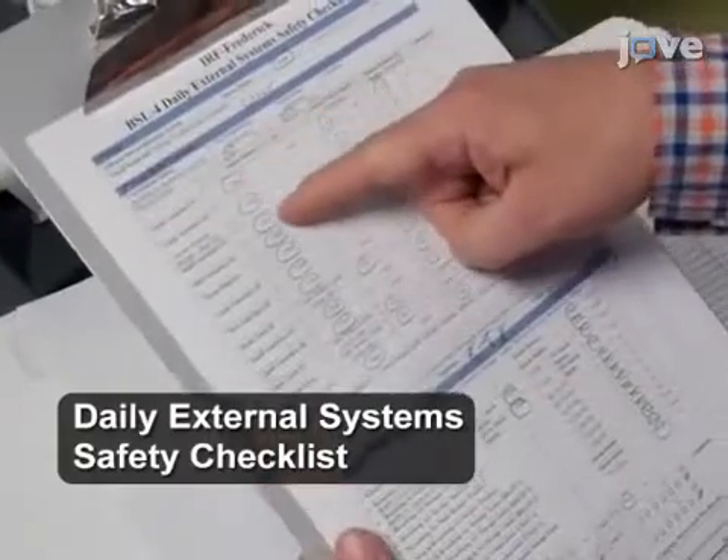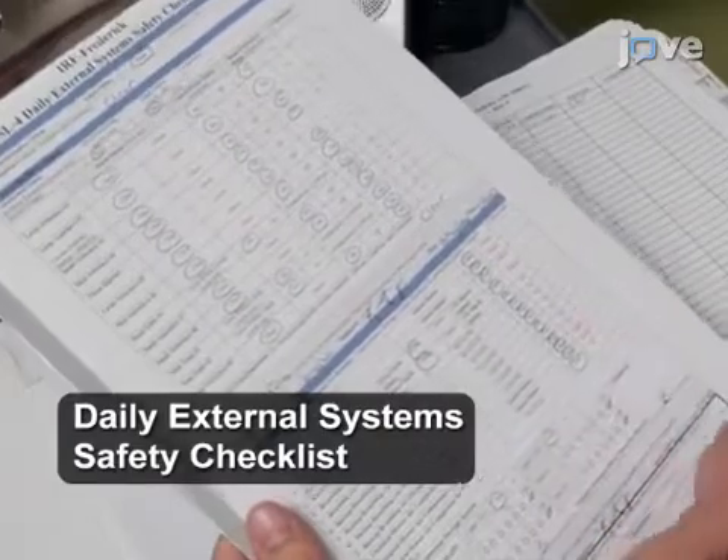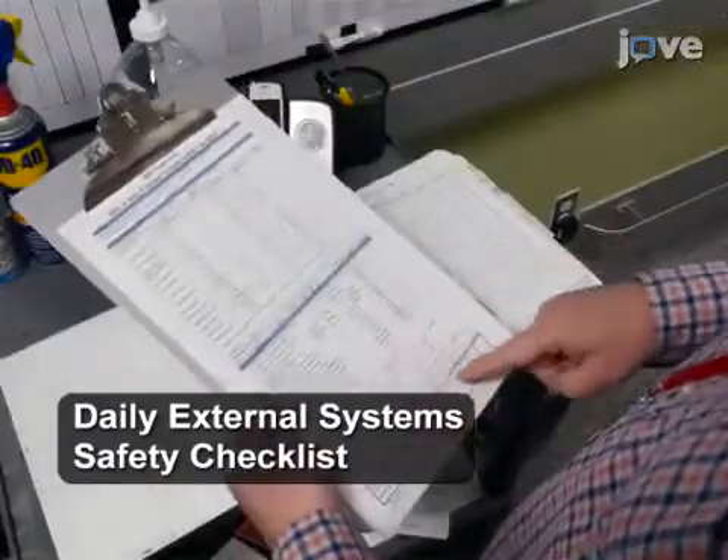To ensure that laboratory room pressure is within negative pressure set points that maintain proper directional airflow, consult the completed systems checklist.